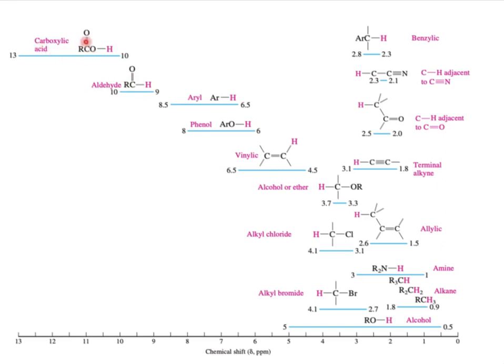You can see oxygen is highly electronegative as compared to the carbon. And then there is this carbonyl pi electron resonance between this oxygen and this oxygen, right? So as a result, the electron shared by the oxygen and the carbon is pulled by this resonance, right?